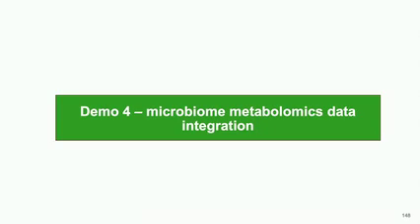Yes, I have a question. I might have missed it. The integration we are talking about, is it the integration of data acquired on different samples from the same person, like microbiome data, for example from saliva, and metabolomics data from blood, like serum or plasma? Can it be integrated, or will it make sense to integrate them?